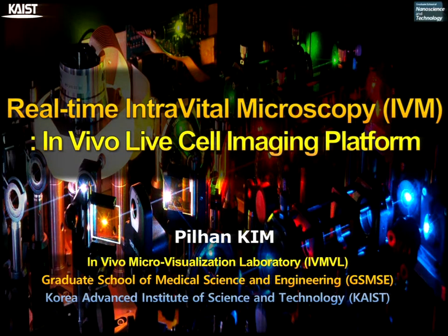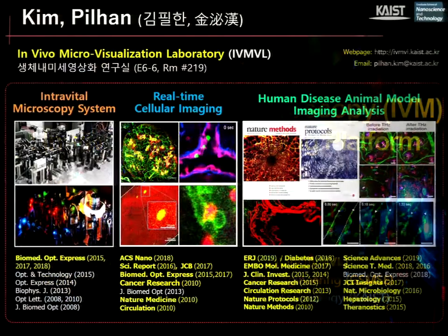And then it's my great honor to have the opportunity to present my work in this great symposium, great conference. Okay, so my talk is about the IntraVital microscopy technology, which can be used to do in vivo live cell imaging in a live anesthetized animal model.